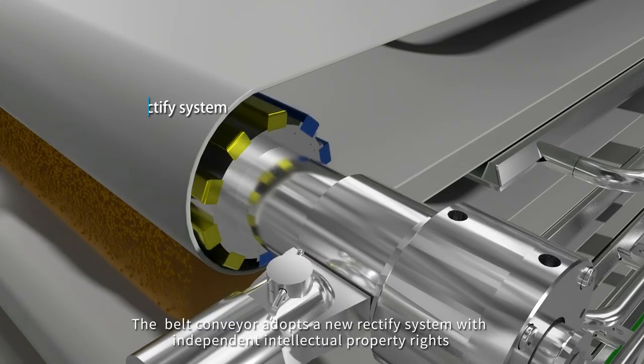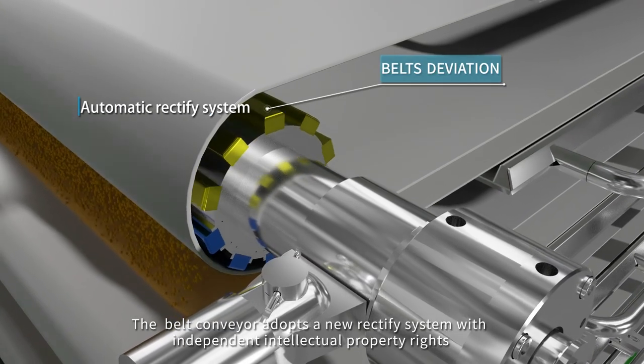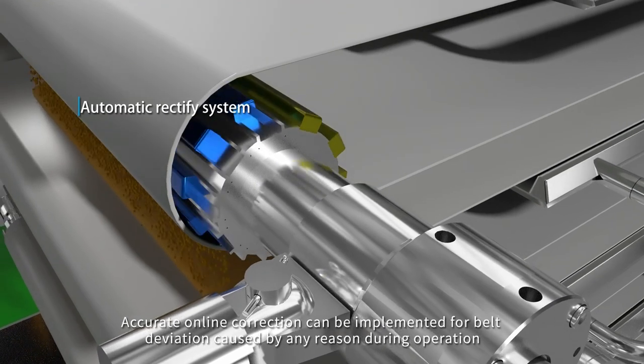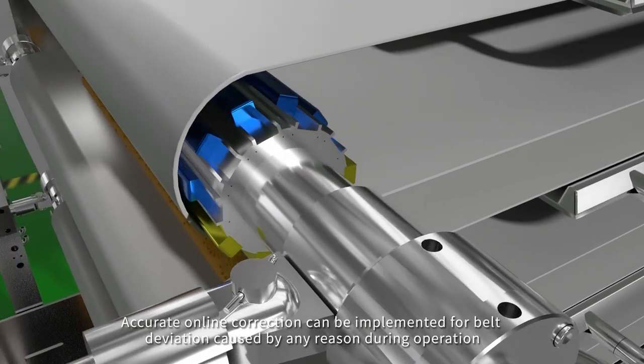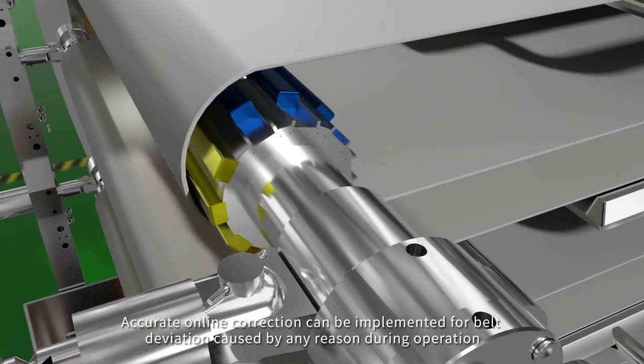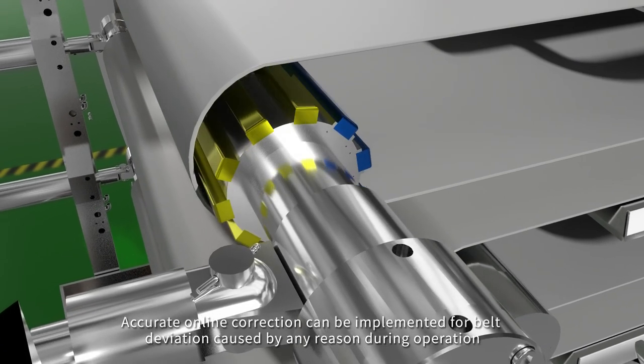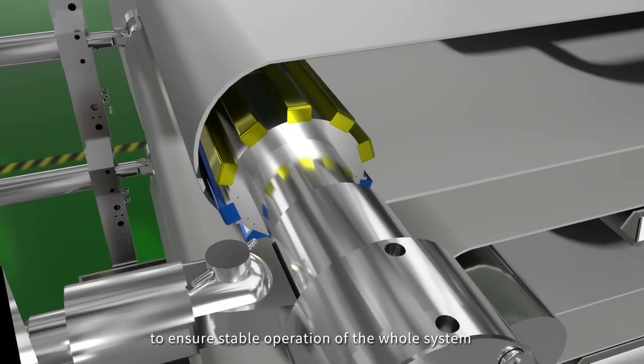The belt conveyor adopts a new rectified system with independent intellectual property rights. Accurate online correction can be implemented for belt deviation caused by any reason during operation to ensure stable operation of the whole system.